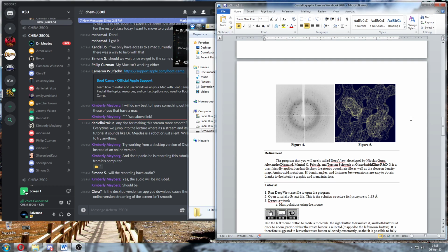So an ideal atom would look like a sphere, right? We don't see the nuclei. Why not? Because the X-rays don't interact with the nucleus. It only interacts with electrons. So all we see is a spherical ball. And if you look at figure 5, in the very center of the picture, there's a sphere of electron density, right? Everybody see that nice big sphere in the center?